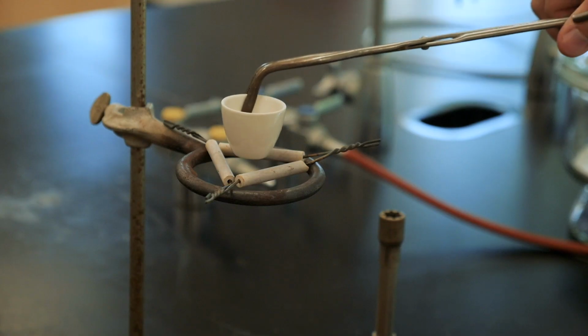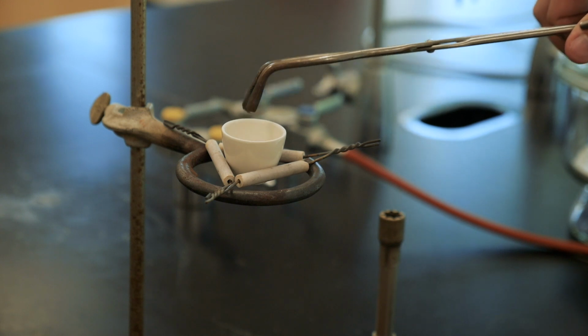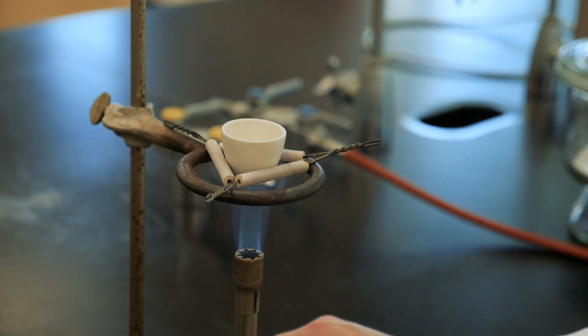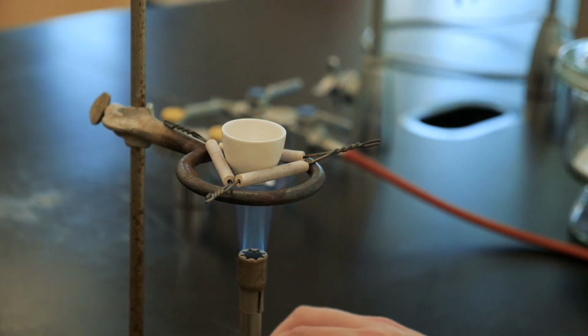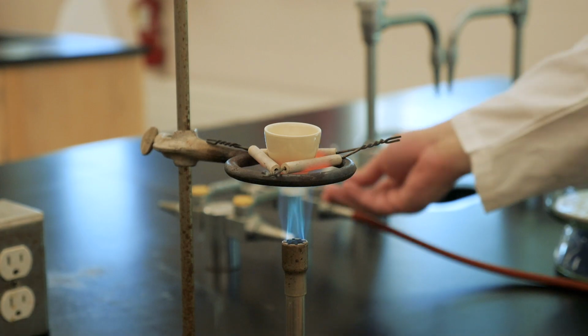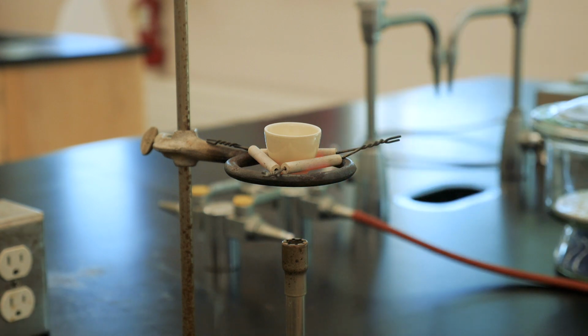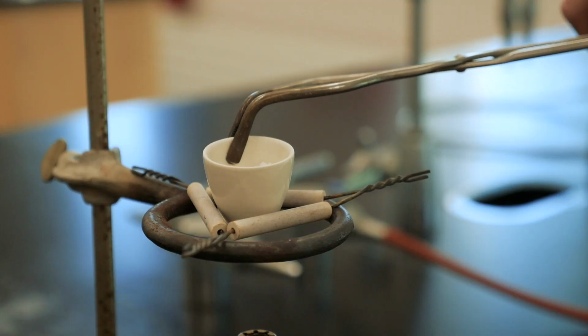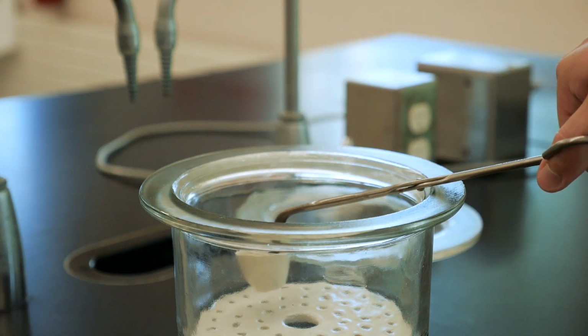The next step is to remove water from the sample by heating it. So place the crucible on your clay triangle and heat it with the Bunsen burner, very gently at first, and then with a full flame for about 10 minutes. After some time, the bottom of the crucible should have a red glow. At the end of the heating, leave the crucible on the clay triangle and allow it to cool in the air for 2 to 3 minutes. Then, using tongs, of course, place the crucible in the desiccator for about 10 minutes.